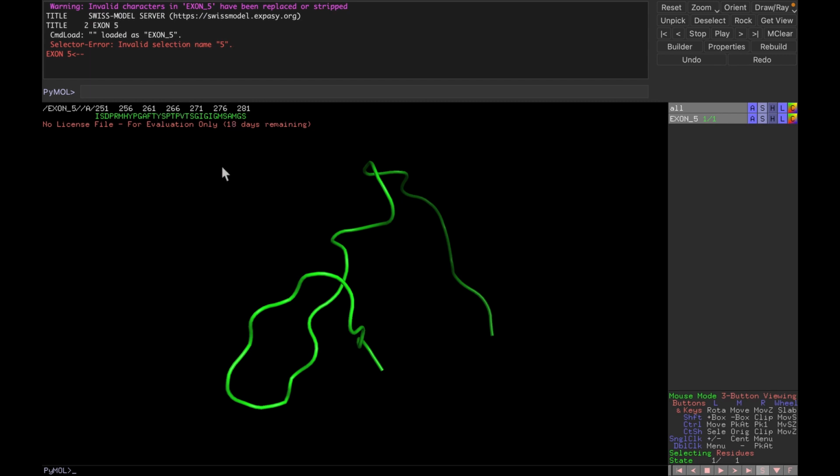Now if you want to modify this sequence, or you want to highlight any residue, then you have to select your residue of interest here. Like if I want to select 266 residue T, I just select it, and here is the place or location where you can do all the changes related to this residue.